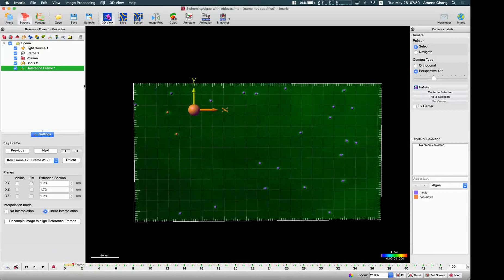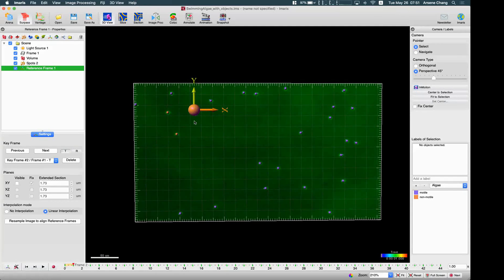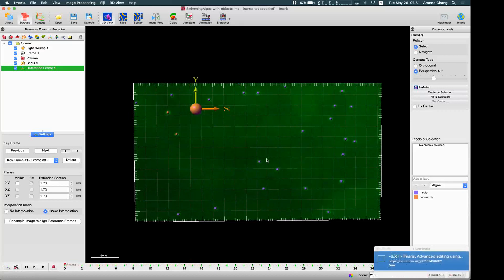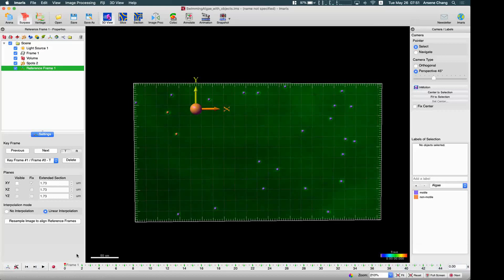As we mentioned in a previous training session, adding a reference frame actually creates another coordinate system. All the statistics results related to position will have another statistic relative to the reference frame. If you use a reference frame, you can animate this drift correction without changing the raw data. So here I have the reference frame — if I play it, you can see the reference frame is moving.